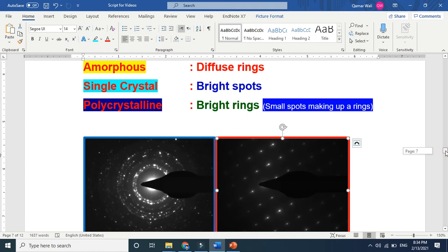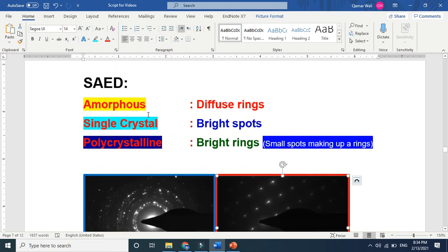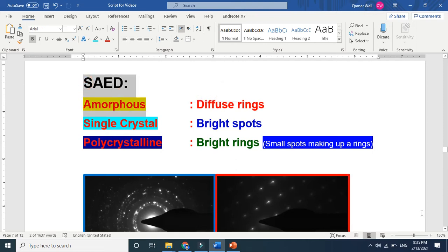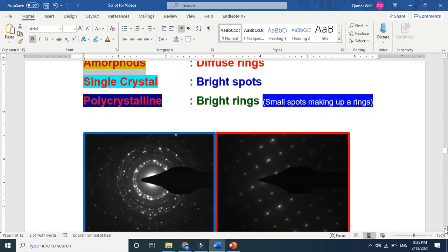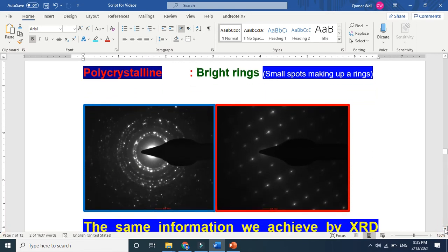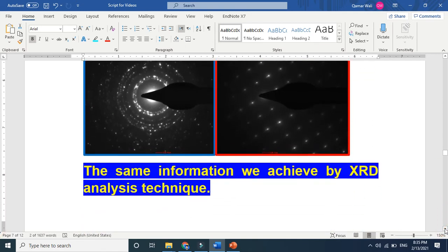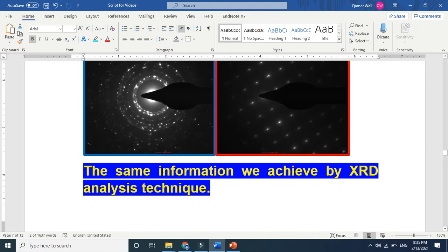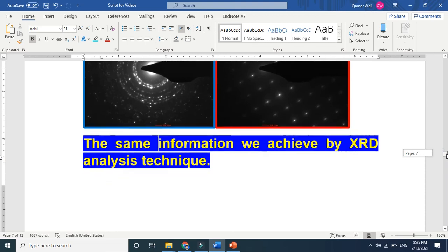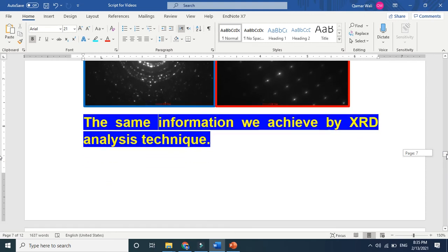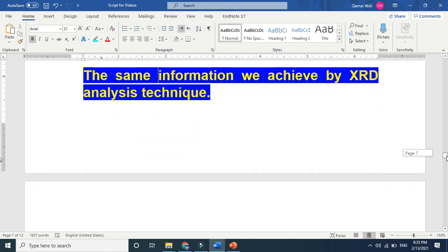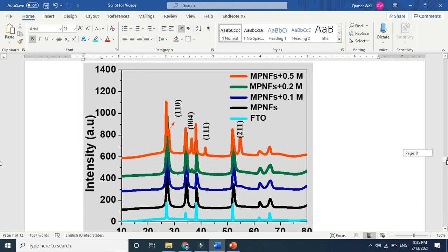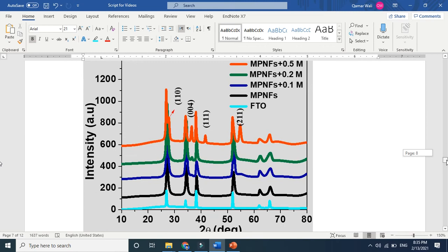So this was basically the three key features of selected electron area diffraction techniques, which is a very very common technique in every experimental work. If you are doing your PhD or master or whatever research. Now, as we explained it, SAED gives us about the nature of the amorphous. It tells if it's amorphous, single crystal or polycrystalline. The same information we get from XRD. There is no difference. And this is the XRD pattern. It also tells whether the material is crystalline single or polycrystalline amorphous, as I explained in my previous videos.